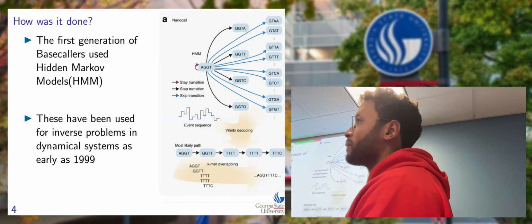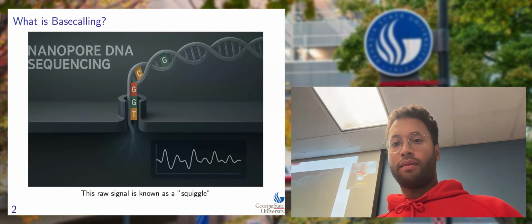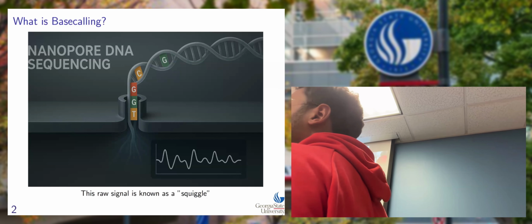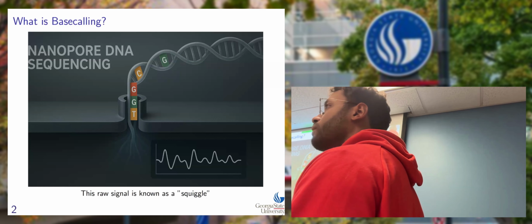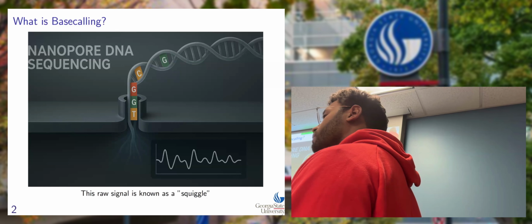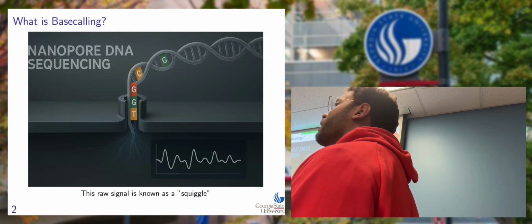So it's related to the technology itself, the equipment. If you go back to your ChatGPT, yeah. Over here, when the single DNA strand slides into the hole, there is a physical reader that reads the electrical signal, the squiggle itself. That reader cannot read at the scale of a single base. You just let the DNA slip in, and you have no control over single base movement. Due to gravity, the DNA just slips in. You cannot control the amount of DNA that passes through the electrical. Yeah, it's a variable speed.